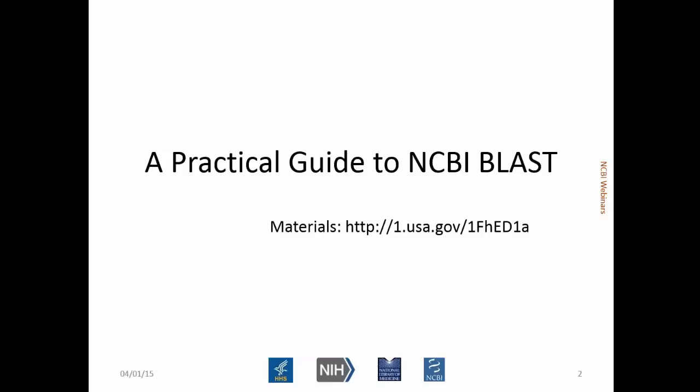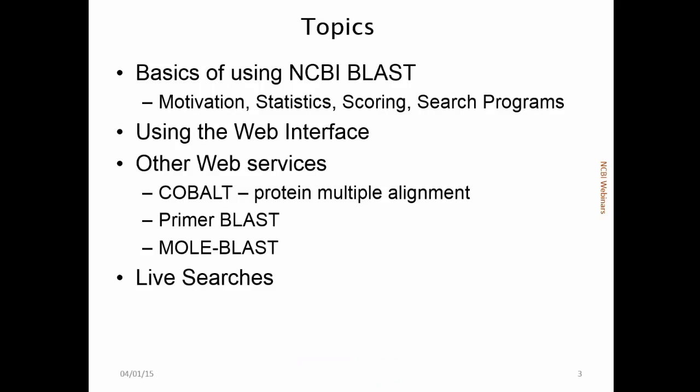So if you want to go back and review some of this stuff, if you follow that materials link that's on this slide, and we'll make that available after the webinar as well, you can probably reproduce some of the examples. So we're going to talk a little bit about what BLAST does. Why would anybody use BLAST? BLAST statistics, what they mean, BLAST scoring, how it works, and the various search programs that we have.